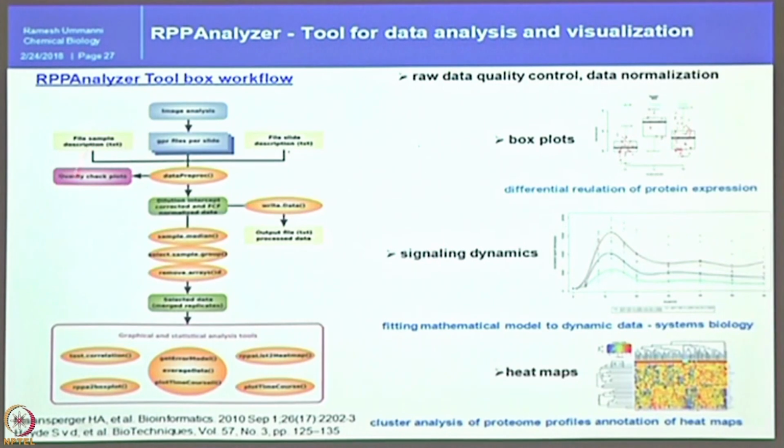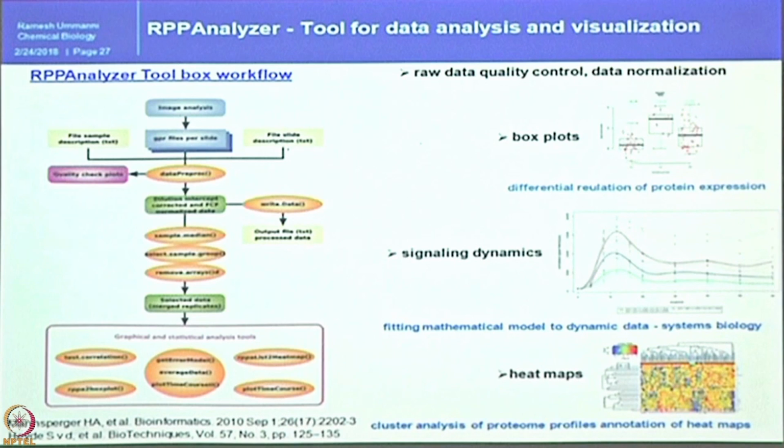Then obviously, once we have the quality control check, we always try to print a pool of samples in a serial dilution method. The serial dilution will tell whether the antibody has detected the serially diluted samples, the linearity is there, and the R value is at least above 0.9. I mean 1 is always ideal, which will never be achieved. So, at least 0.9 is the cutoff.